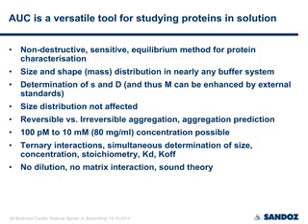The good thing is you don't need the exact determination of the protein concentration. Okay, I hope I could show you AUC is a really useful and versatile tool for studying proteins in solution for the biopharmaceutical industry. It's non-destructive, sometimes very useful if you want to recover it afterwards. It's sensitive, it's an equilibrium method, nothing enters the cell, nothing leaves it. You can have size and shape and also mass distributions in nearly any buffer system.